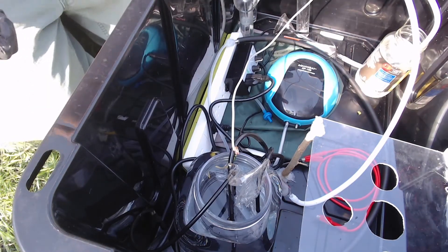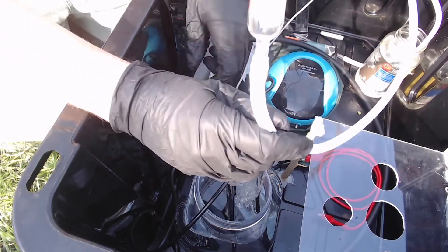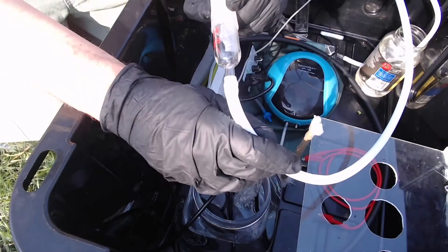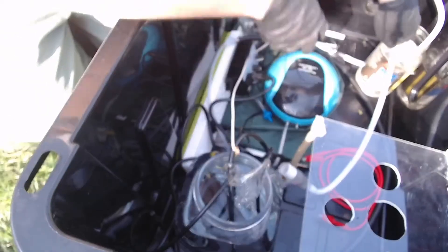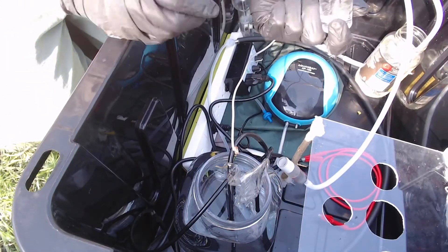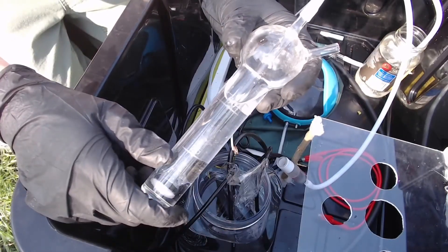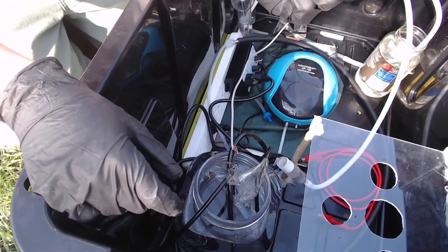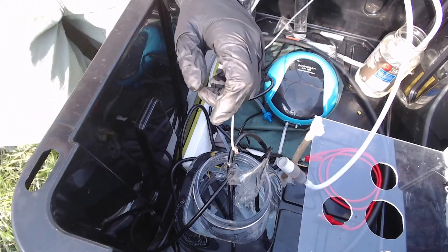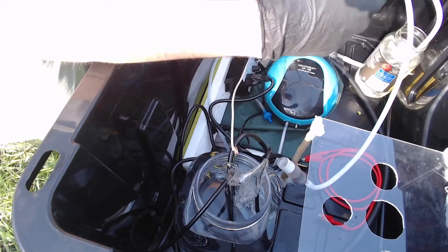Over here we've got the scrubbing system. It runs off one of the inert gas adapters modified with a little Teflon tube coming off the bottom, running into the beginning of my three-scrubber system — it was a four-scrubber system, but that provided a little too much backflow. Pretty simple: 50 milliliter SO2 scrubbers being used for HNO3 scrubbing. An aquarium air pump — fairly simple.